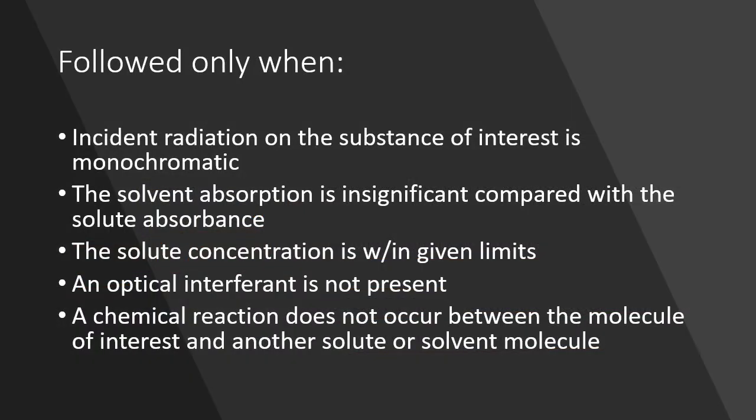Now, this can only be followed when the incident radiation on the substance of interest is monochromatic. This is very important. That's the reason why spectrophotometry is also used in measurement or analytical purposes, because it can produce monochromatic light. Next, the solvent absorption is insignificant compared with the solute absorbance. The solute concentration is within given limits.